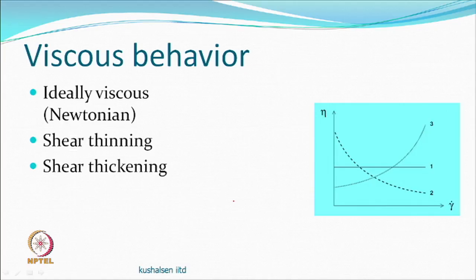So, liquids, which is a solvent first, then you dissolve something in them, and so their behavior in terms of the shear rate, and shear stress and viscosity on one side if you plot. If it is an ideal solution, then this is the way it will behave, an ideal, all right. So, it does not matter at what rate you are pulling, because it appears each layer is independently moving, only you are worried about how much force I have to require.